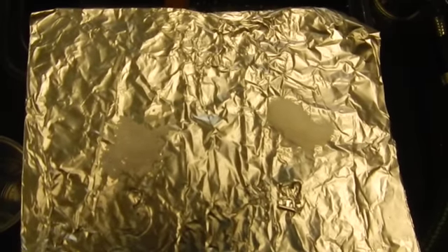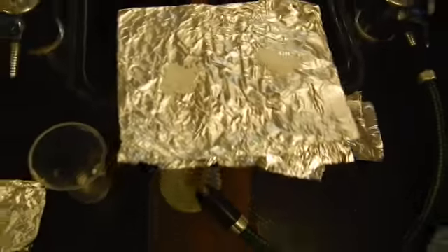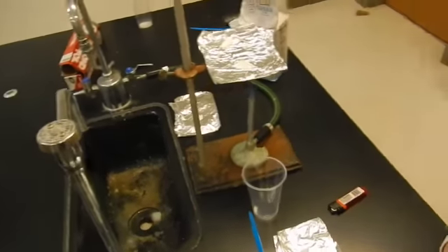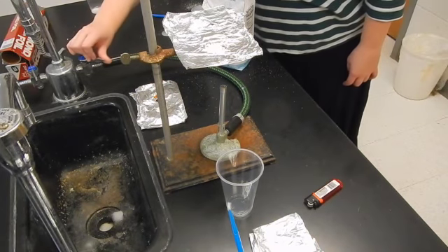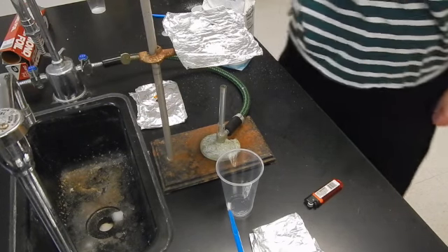This one is number 3. That one is number 4. Turning the gas completely off.